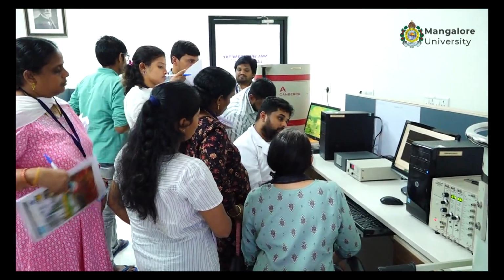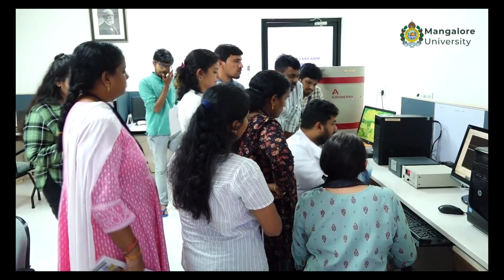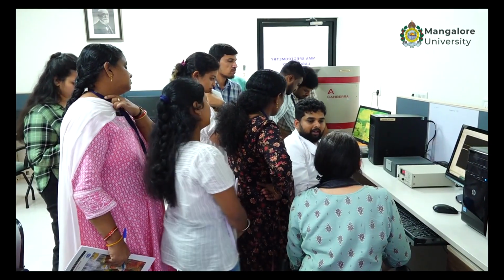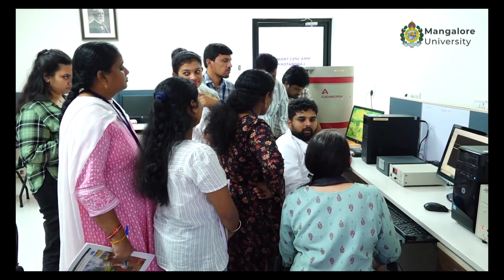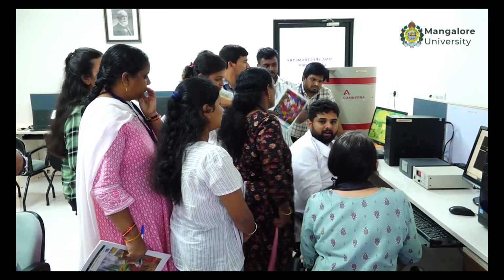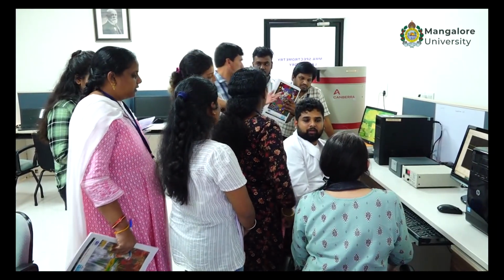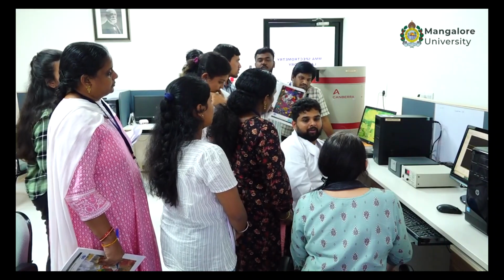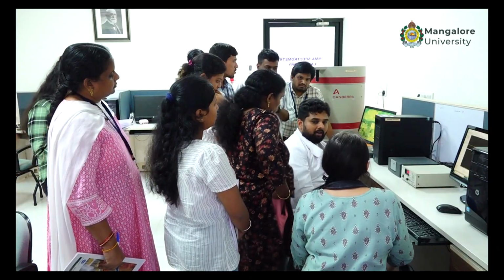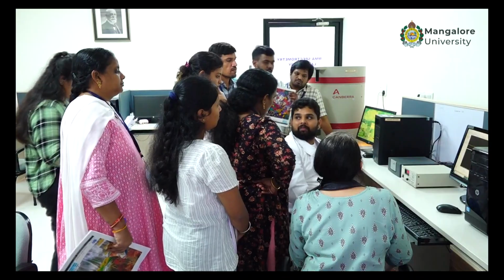Sometimes we do calculations also with this, because the HPG is quite expensive. As Roy sir told, they are paying around 100,000 euros for this HPG system in Finland, but here it might be more than 1 crore. So it's not affordable for every laboratory to have it. In that case, results from sodium iodide, or standard calibrated sodium iodide, are acceptable. But the standard deviation would be very high, correct?